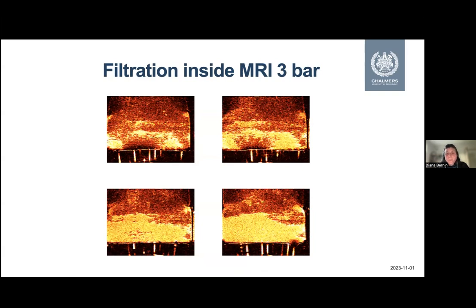filtration. But it's always, when you start a project with MRI, you need to know a lot of things about your system before. Which time scale things are happening, and then you have to design the MRI experiments according to this. There are so many pulse sequences available, the same also with NMR, so it's very good to know what you're looking for before you start.